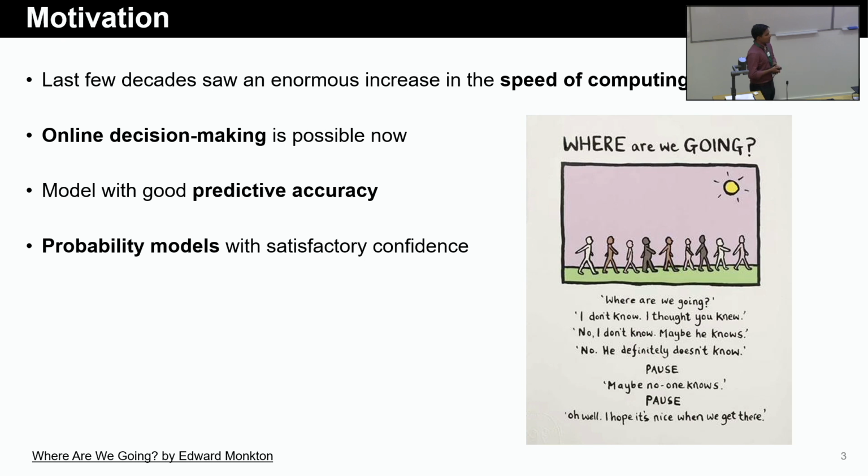In order to make the decisions reliable, we need to develop models with good predictive accuracy. Also, if we are applying these models on a real-time process, we have very limited data sets. So using those limited data, we need to develop these data-driven models in real time. The challenge is that we really need to design the data to train these models carefully. So we need to design the most informative data set so that we don't need big data.